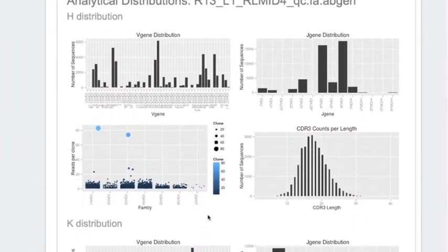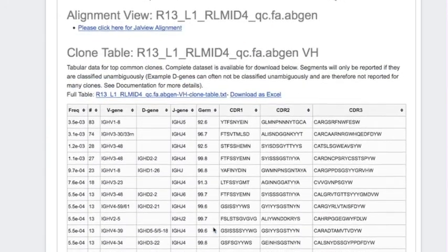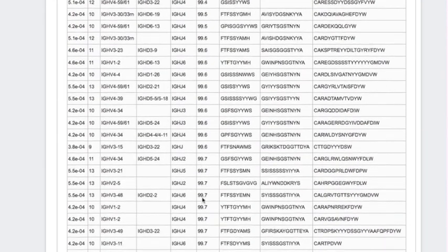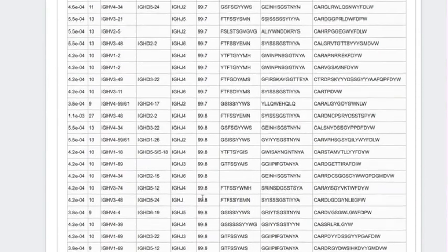I find a notable suppression of clonal expansion. It looks like there's a couple of members that have clonally expanded, and this axis is notably altered in the number of sequences I've seen, with the vast majority of reads showing up only once. And when I look at this person's individual antibodies, sorting by germline, I find that the most dominant clones in this person that showed up many times look like they have some affinity maturation, but essentially everything else is almost entirely germline, down to probably the read error rate of the high throughput sequencing.